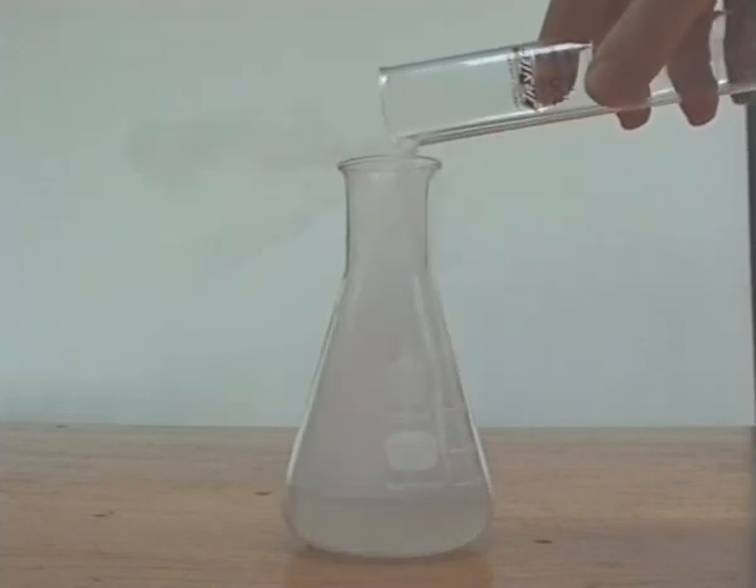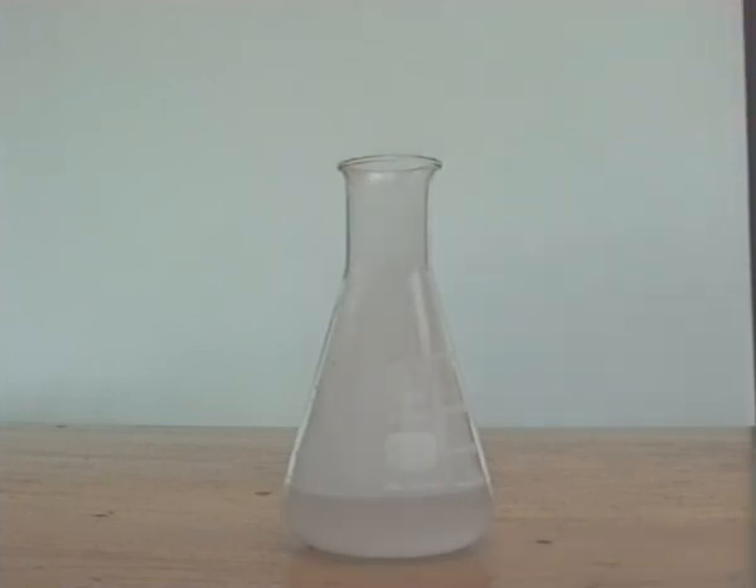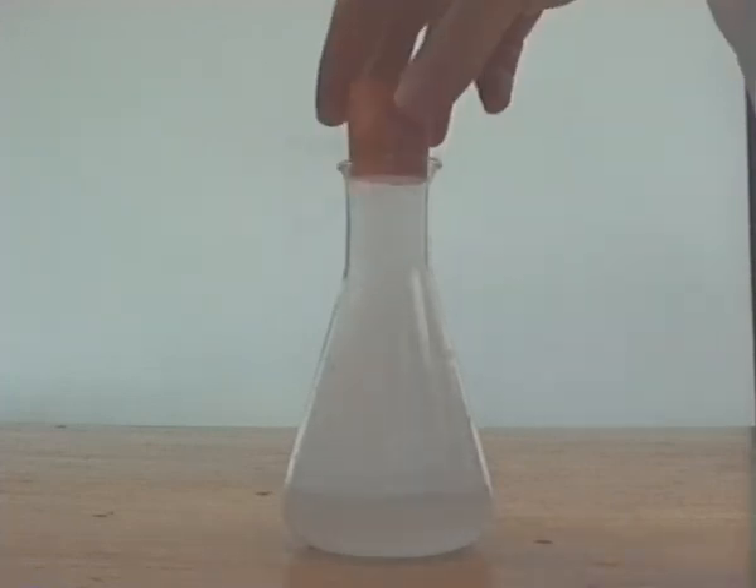The flask was lightly stoppered and shaken for around 20 minutes. Care had to be taken to release the pressure regularly, as you will see, it can build up quite quickly.